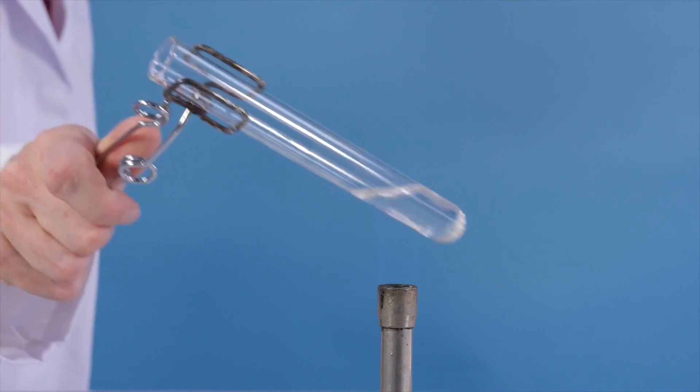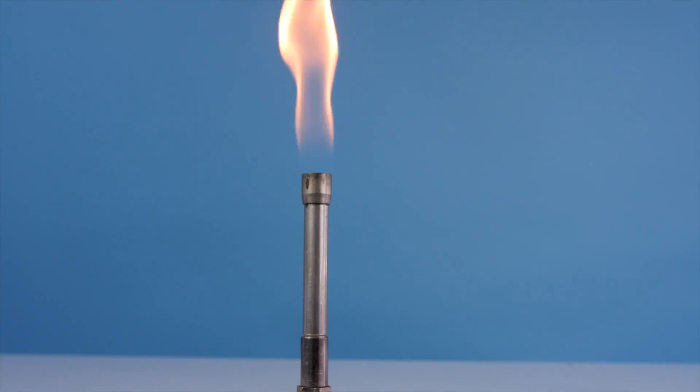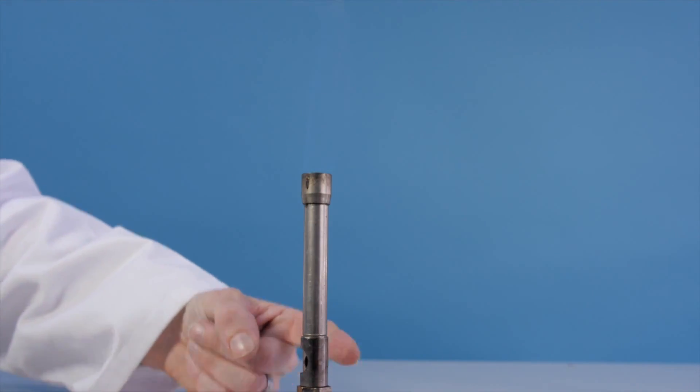Next, gently heat the solution by passing the test tube slowly in and out of the flame. Notice the air hole of the Bunsen burner is half open.